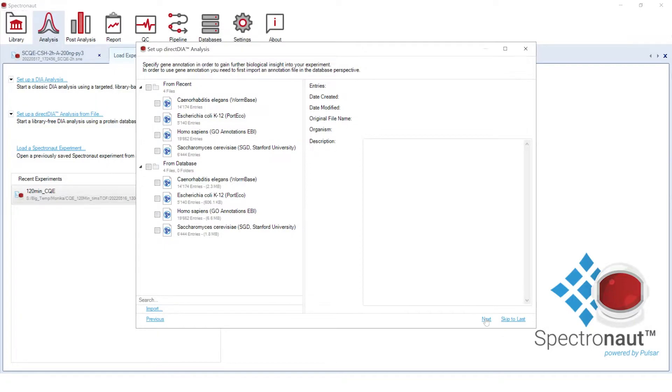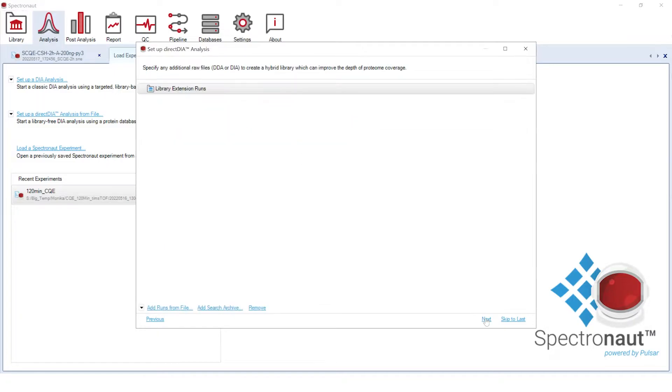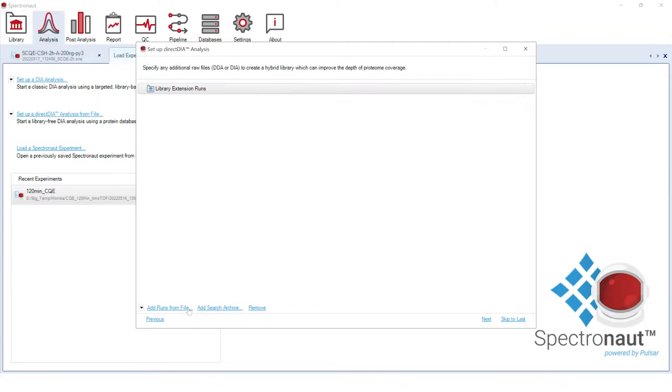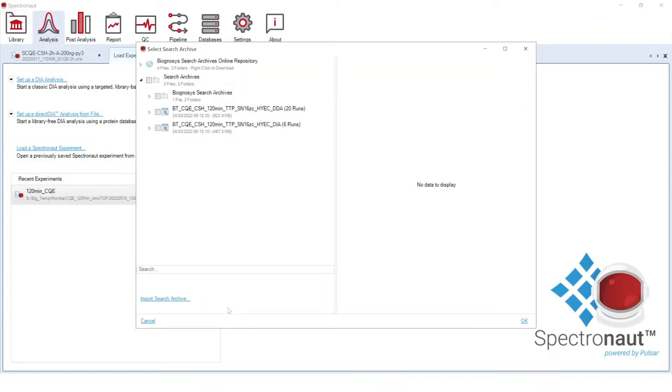Finally, we can select additional DIA or DDA runs for the Pulsar search. Those runs will be used to enrich the project-specific library and improve the depth of proteome coverage in the analyzed DIA project. Since searching is a computationally and time-consuming process, another convenient solution for library enrichment, when available, is the selection of search archives, namely the combined PSM search results of the additional DIA and DDA runs.